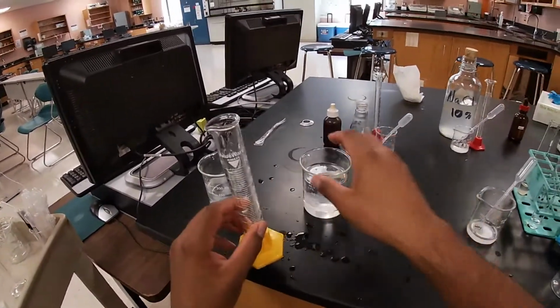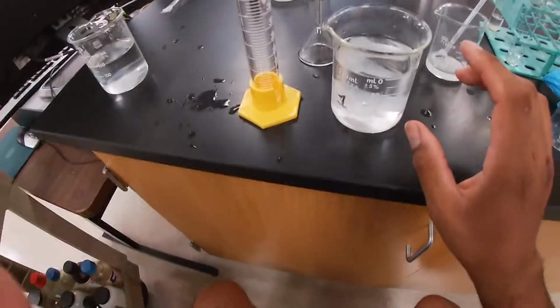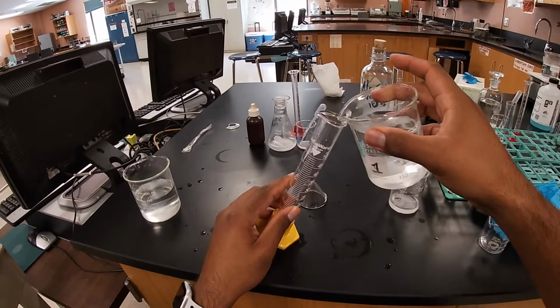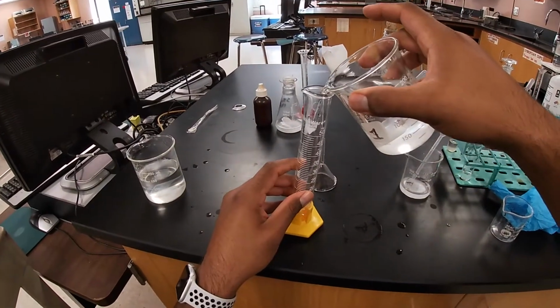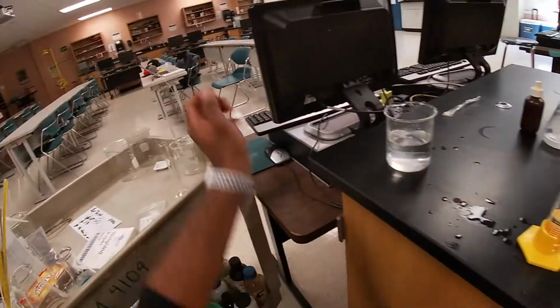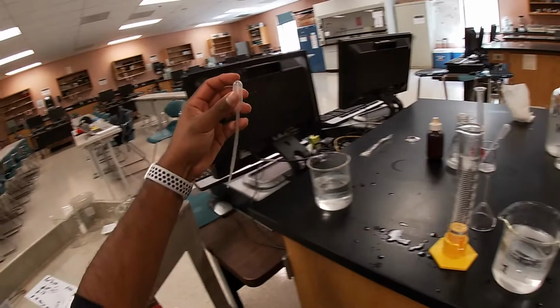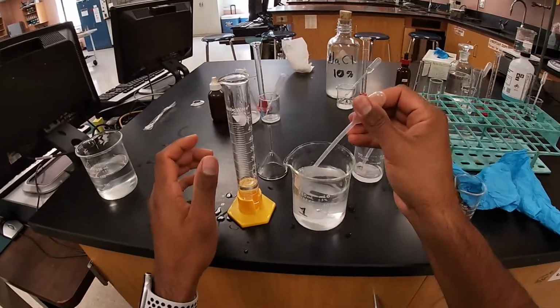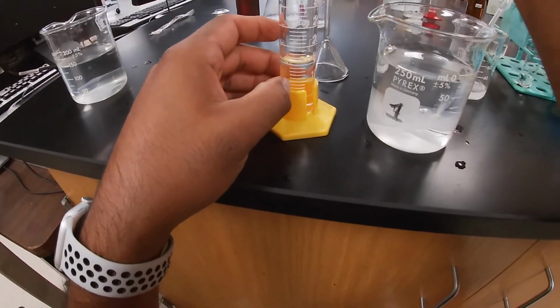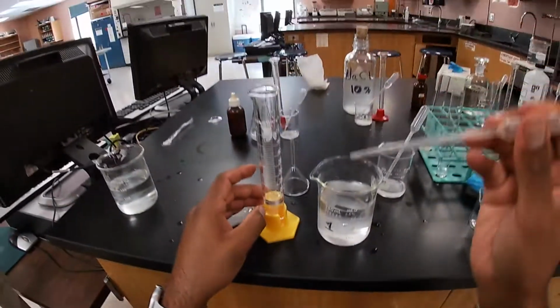Okay, so now that we have completely submerged our dialysis tubing, as you can see, hopefully. Hopefully I'm not recording all whack. We're gonna measure out 15 milliliters of water. And then from this here on out, we're gonna go ahead and pipette out so that we get our 15. And we are at 15.